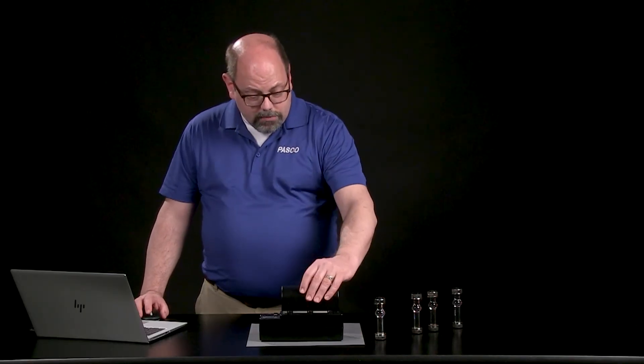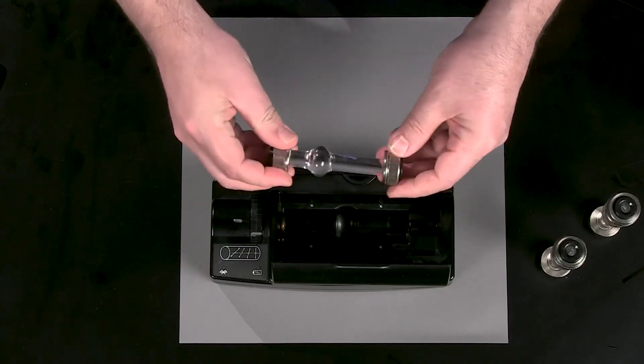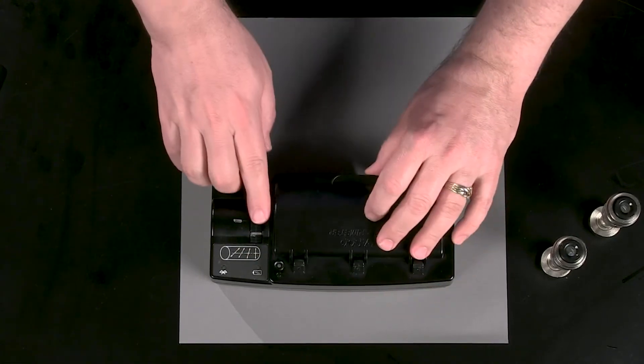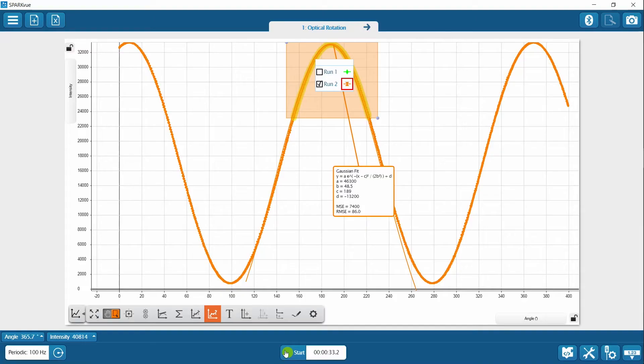Now we're going to put a new solution in, and that's going to be a 6% solution. I'll orient this the same way, put the label at the top, scoot the cell over to the right, make sure this is a little ahead of the starting reading, and let's make a second run.